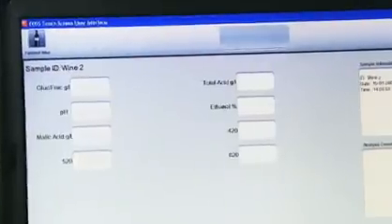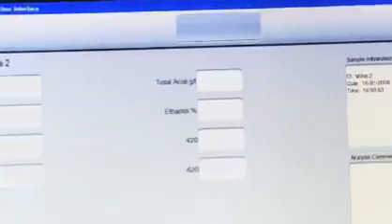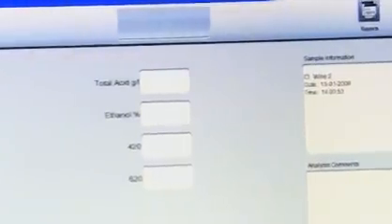Wait a few minutes to get the results. This is an ideal time to register your sample via the computer software. Note that the sample registration form can be customized to your requirements when the instrument is installed. You can then keep an eye on the progress of your measurements.